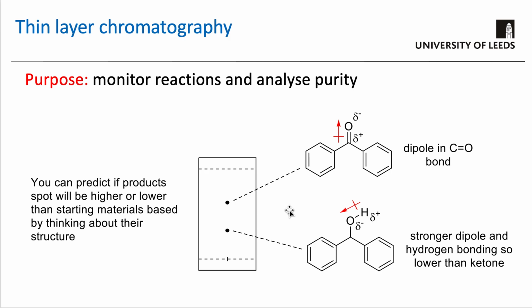It's very much like if you have done the experiment with a piece of filter paper and put some ink onto the filter paper and then put it in water. You see the different chemicals, the different colours in the ink, separating out because they've got different chemical structures. Well, that's exactly what's happening with a TLC as well. And then you run your TLC in the solvent and let the solvent run up to the top of the plate, and then you analyse and see how far the spots have travelled up the plate to see what's in your mixture.